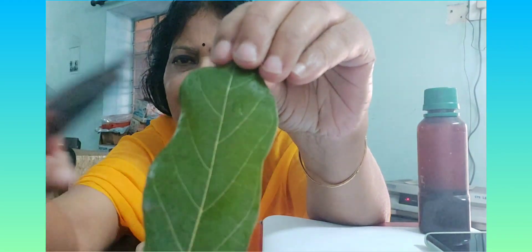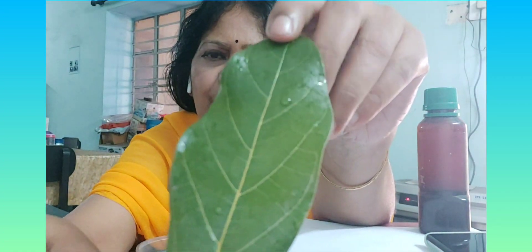The back side of the leaf is pale green, while the upper surface of the leaf is bright green. The reason is this is a dorsiventral leaf. This is a dorsiventral leaf because it has more stomata on the lower surface of the leaf and less stomata on the upper surface of the leaf.